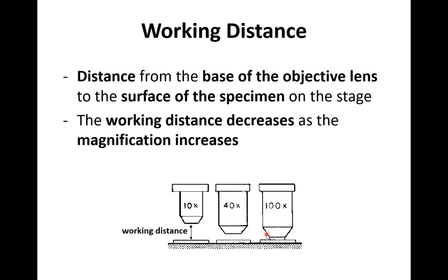That's one of the problems with microscopy at the beginning, and that's the reason why you use a cover slip: some lenses get so close that you can actually touch the sample and get dirty.